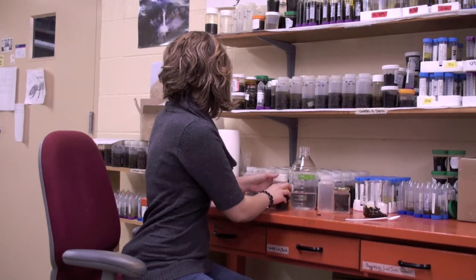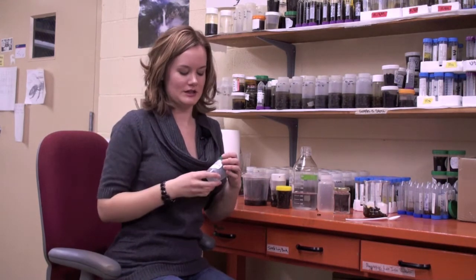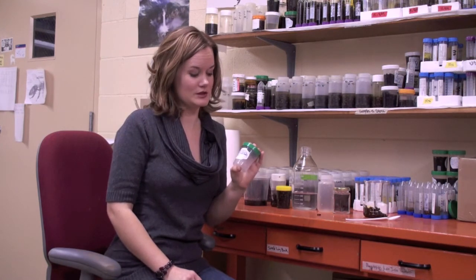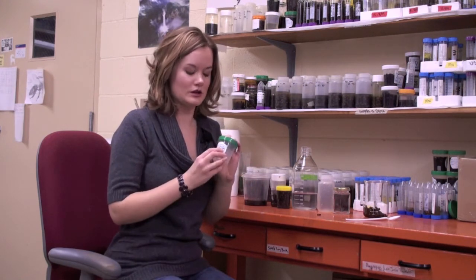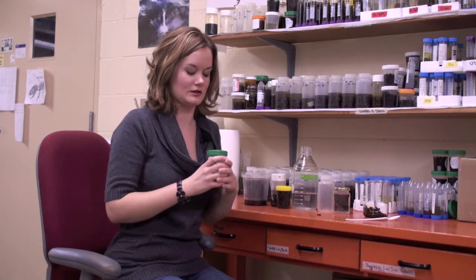And the next step, you can also use a urine sample bottle. And these are actually really good. You can get them for 50 cents at your local pharmacy, but they usually have this tape sticker on the outside. And what you can do is write the date that you sampled on it. So not the date that you're sending it to me, but the date it was actually sampled, and then the colony number, and then your name on the side of it. Now on the lid, I'd like you to put the colony number.